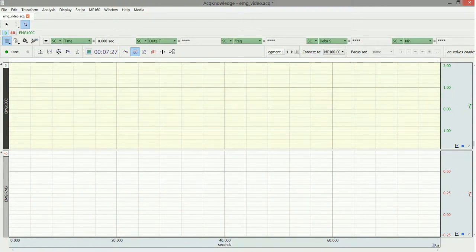so that when you analyze the data afterwards, you can compare the video, usually of the subject, with the data, so that you can see if there's some strange things happening in the data. Then you can just look into the video, and probably it's very easy to see what is happening if you have some artifacts, or the video gives more information when you interpret the data.